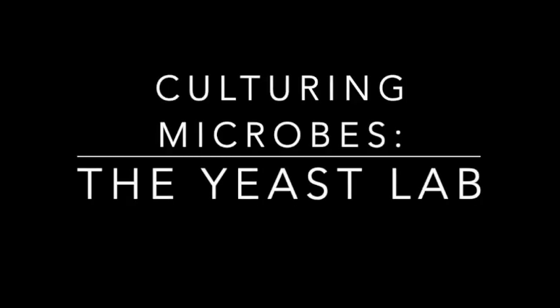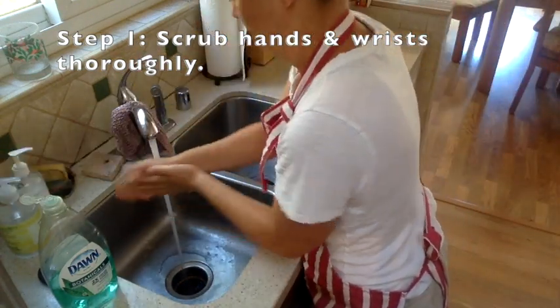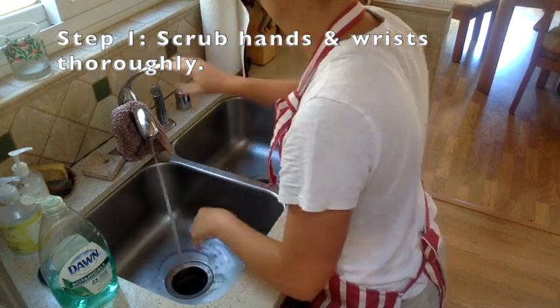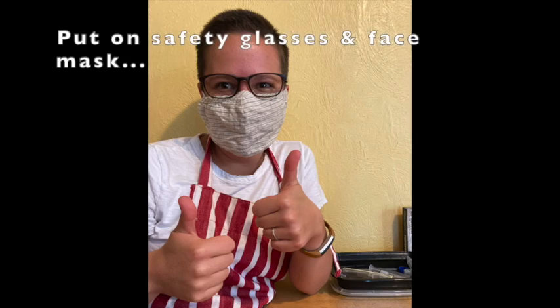Welcome to Culturing Microbes. This is the Yeast Lab. The first step is to make sure that you scrub up — wash your hands really well. You want to make sure that you don't get any contamination from your hands into your workspace. You should work to be as sterile as possible, so wear a mask and your safety glasses.